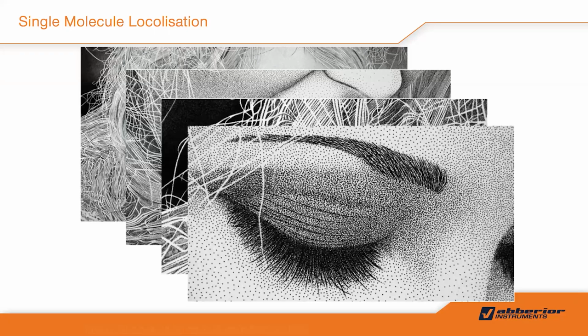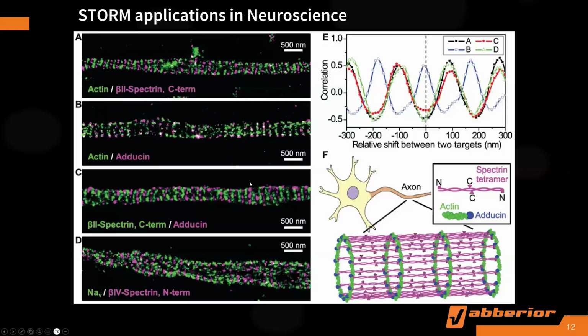And only after that long time, like 1 hour, is it your first time to see that image. So this is a restriction in the application of these technologies. It takes too much time to get to a very nice image. And MINFLUX is a combination of these two.